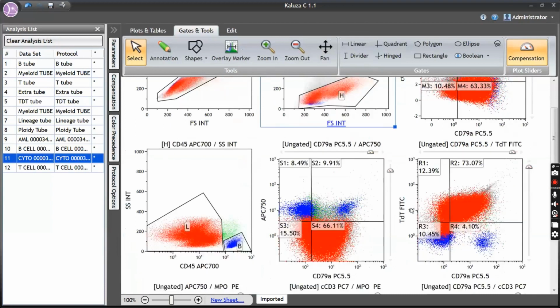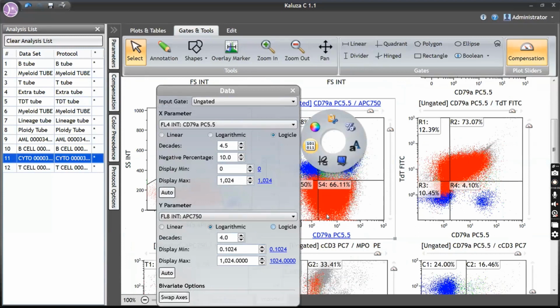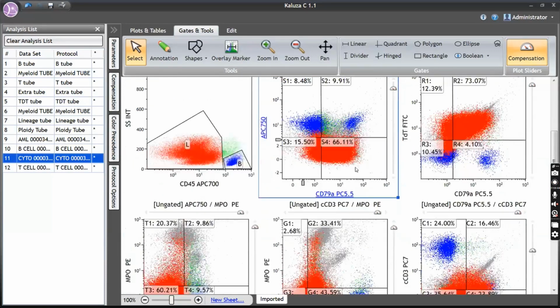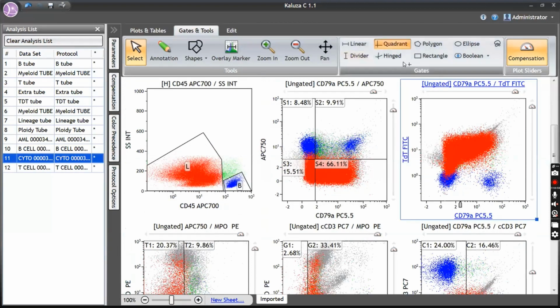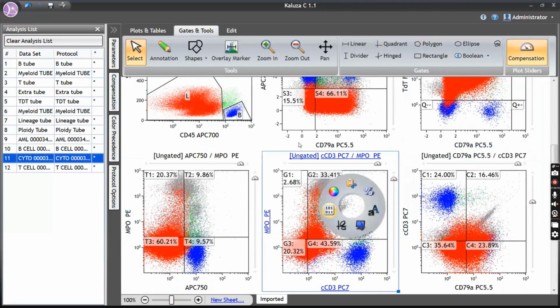Right. So now see the amount of autofluorescence here. There's autofluorescence too much. It looks like an empty channel or unlabeled, but still lymphocytes are coming up to this. So there is some high autofluorescence here. TdT is positive, correct? You see with the internal controls both are negative. One is B lymphocyte and other is T lymphocyte. So if you draw a quadrant like this, the blasts are predominantly TdT positive in a very convincing fashion. Then coming to the other important markers.